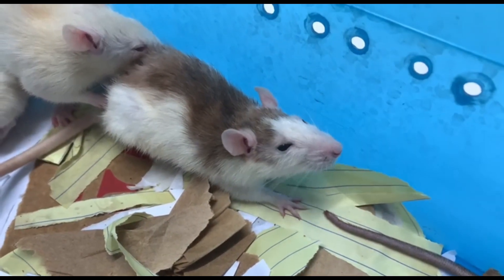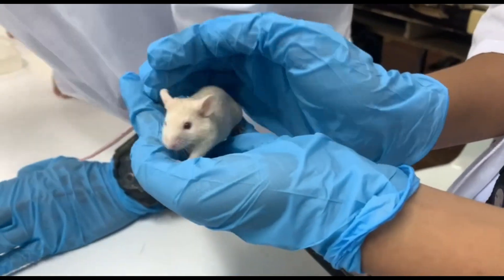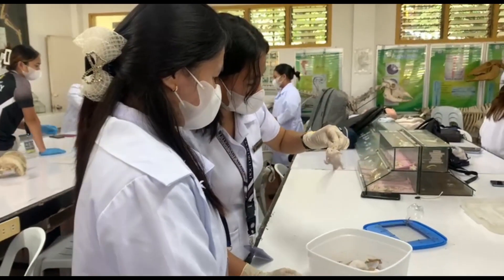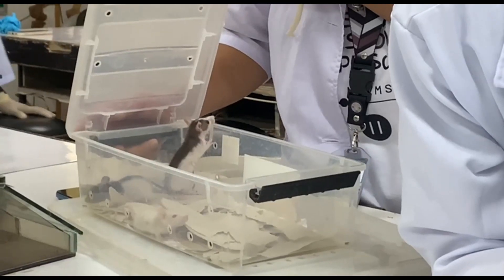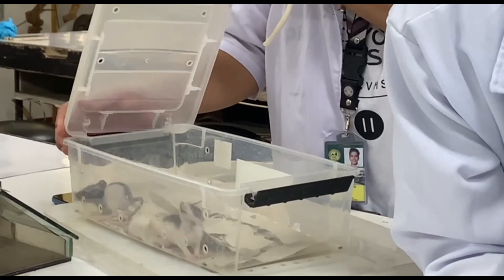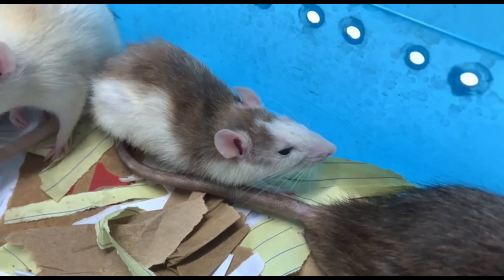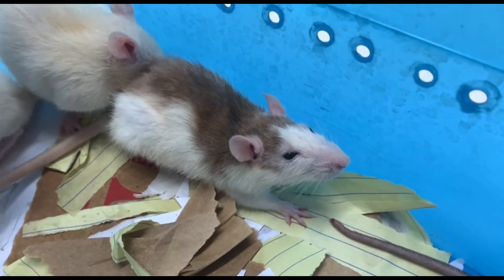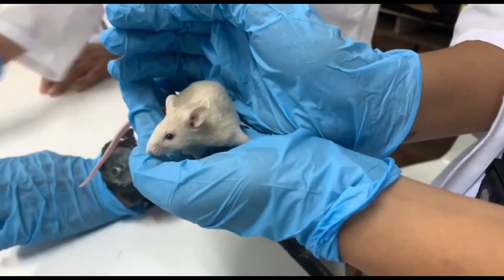The researcher must possess a deep understanding of the behavior and responses of each animal to different stimuli. Here are the objectives of this video presentation: First, to assist laboratory animal researchers in partially complying with the Animal Welfare Act. Second, to provide basic concepts of animal handling and restraint. Third, to minimize laboratory animal distress and discomfort. And last, to minimize animal as well as human injury in scientific procedures using the animals.